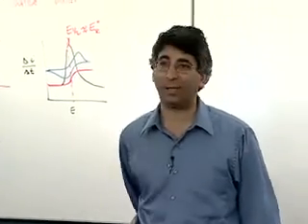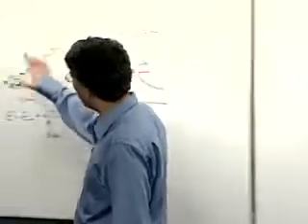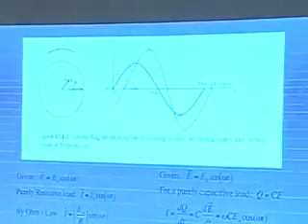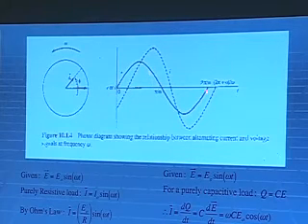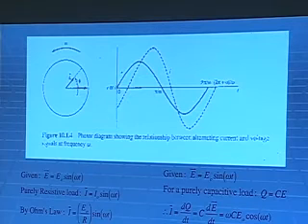Now, what about real AC techniques? Really, when people talk about AC techniques, they're not talking about a time dependence like this, but they are talking about a time dependence where you apply a classical sinusoidal signal to your electrode. So the idea is you have a potential, you put a small potential perturbation there, no DC potential on this, let's say, to start with, and then you monitor the current as a function of time, and you may get out a sine wave that is phase shifted with respect to the potential.